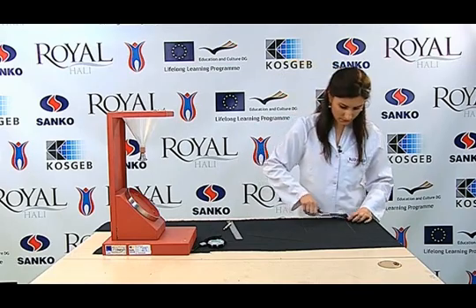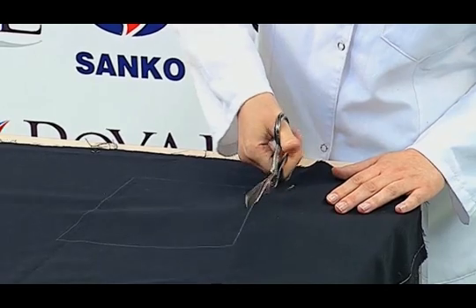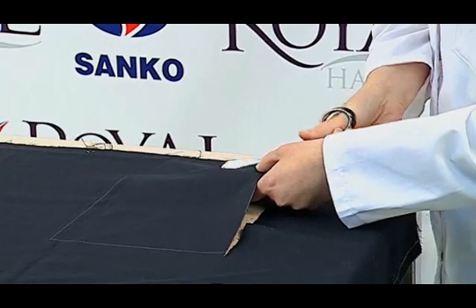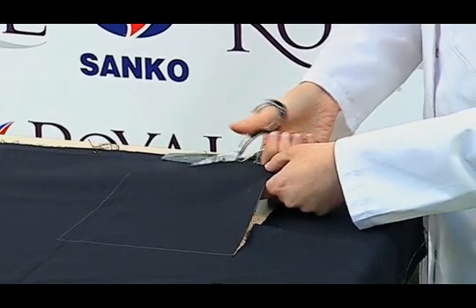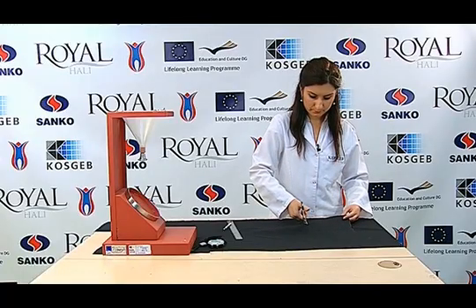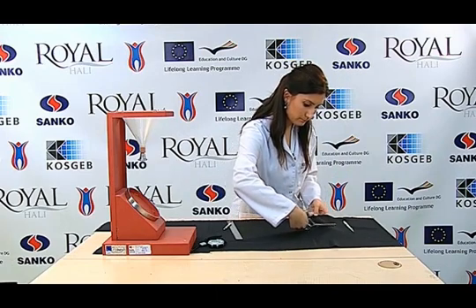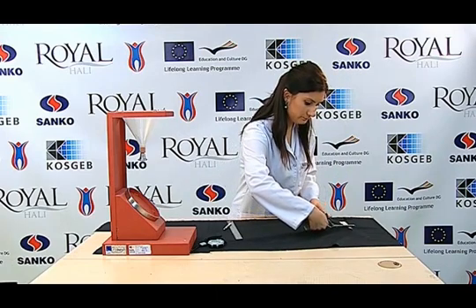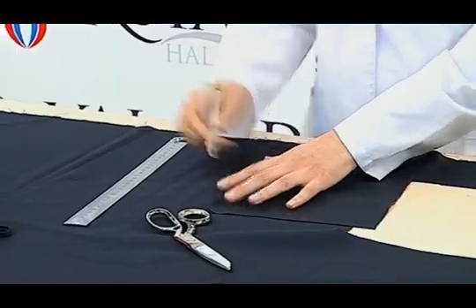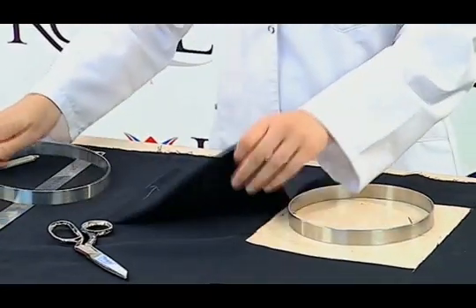Prepared test samples are cut properly with scissors. Then, by marking the warp direction of our sample, we place the sample in the holder of the device, which is wheel-shaped.